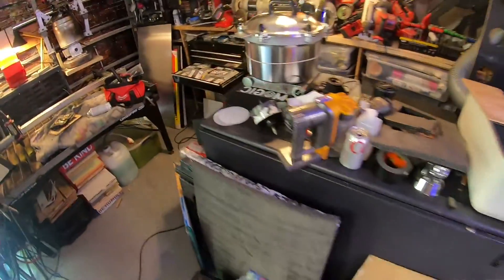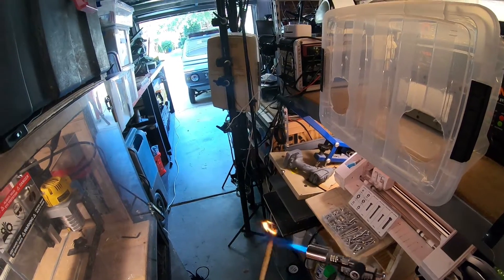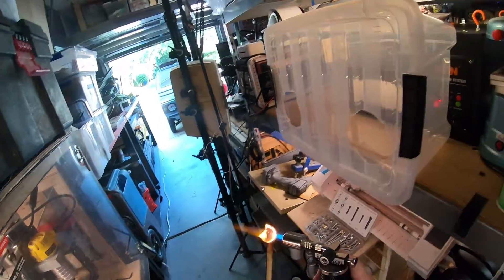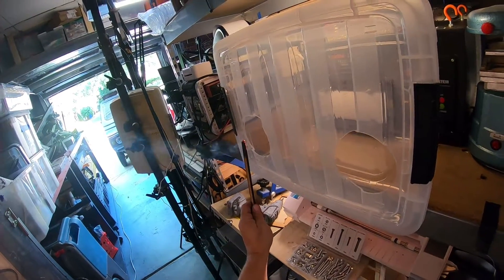Probably the most successful part of this project is that it's done. I got the entire adapter plate working in this bin and my hands fit through quite nicely, so I'm able to add the spores I need right inside of this chamber. You pretty much can use any positive airflow — and you can see there's actually positive airflow coming out of these holes. It's better than doing it in open space. We created a really cool bracket that attached a shop fan to an existing bin that costs five bucks, drilled two holes in it, and created everything it takes to create a sterile environment to start your mycology at home process.